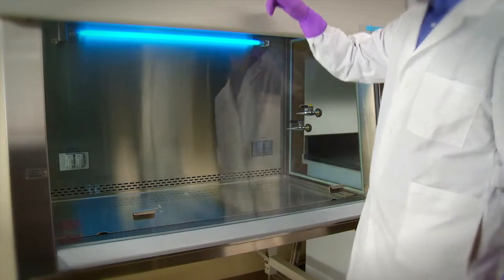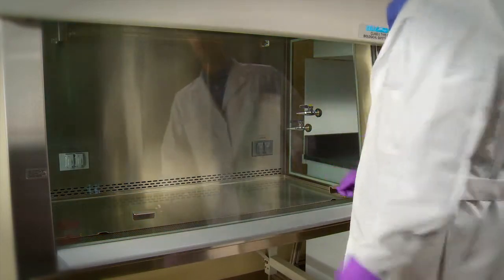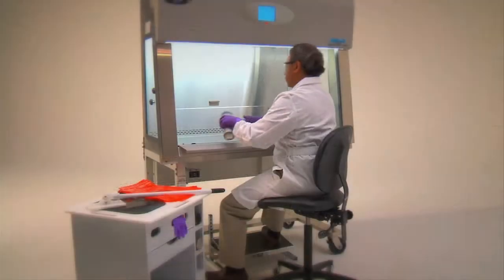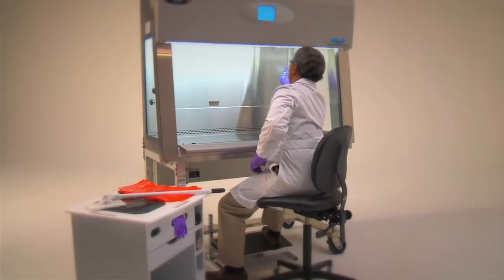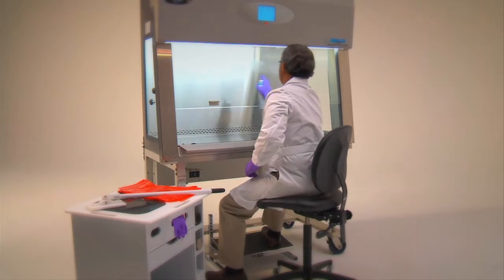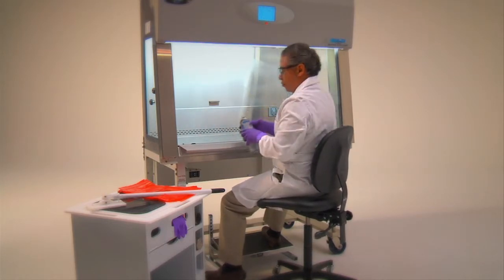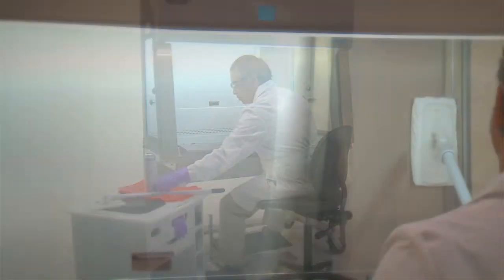Allow the cabinet to operate for five minutes with no activity in order to purge airborne contaminants from the work area. Thoroughly decontaminate interior work surfaces. Twenty to thirty minutes is generally considered an appropriate contact time for decontamination, but this varies with the disinfectant and the microbiological agent.